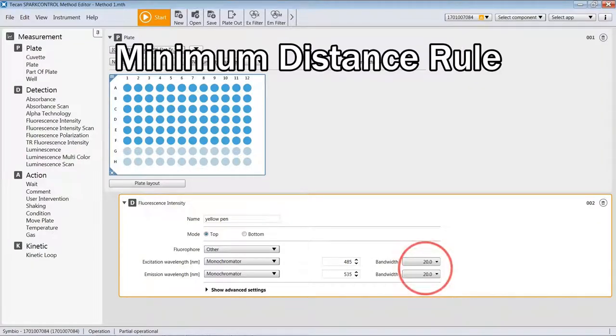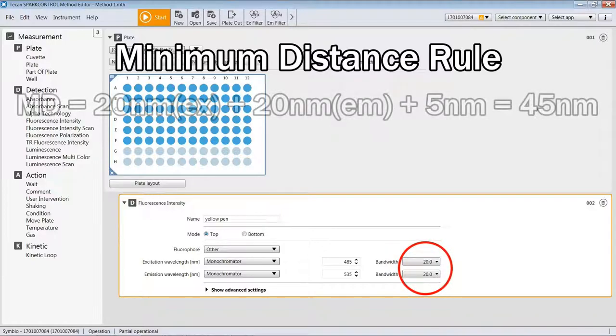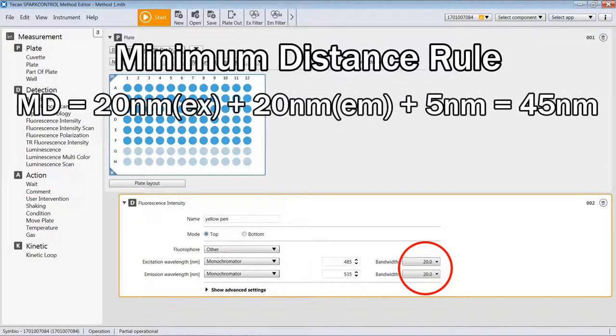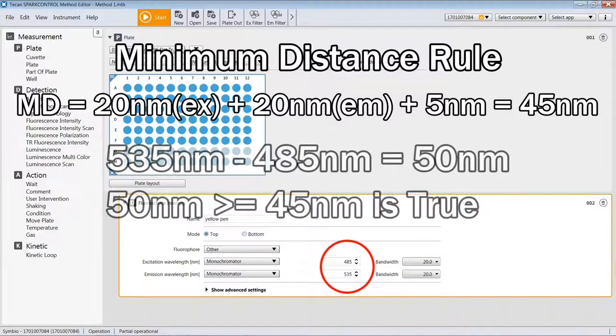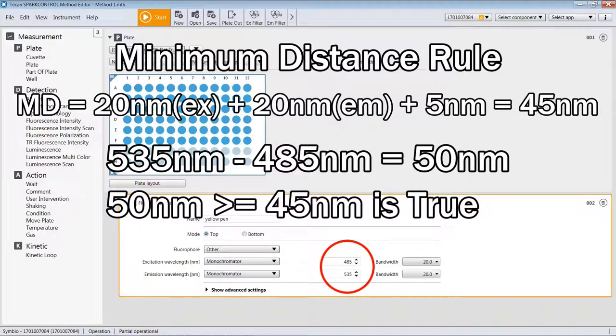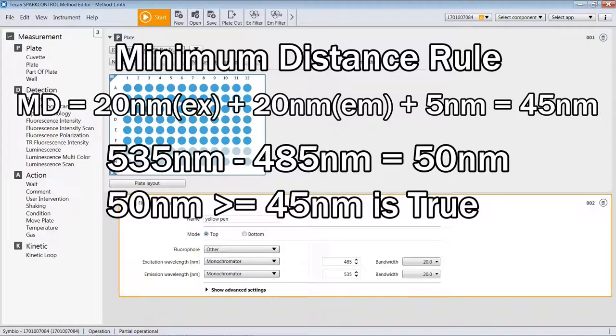To determine the minimum distance of your settings, take the bandwidth of excitation plus bandwidth of emission plus 5 nanometers, and then take the emission wavelength minus the excitation wavelength, and that difference must be greater than or equal to the minimum distance in order to avoid crosstalk. If we evaluate our current settings, the sum of the bandwidths plus 5 nanometers gives us 45 nanometers as our minimum distance. With the current wavelength settings, 535 minus 485 gives us 50 nanometers, and 50 is greater than 45, so we have not violated the minimum distance rule.